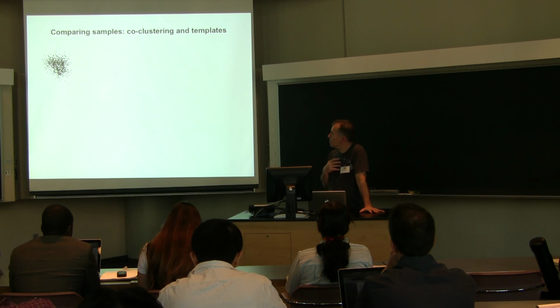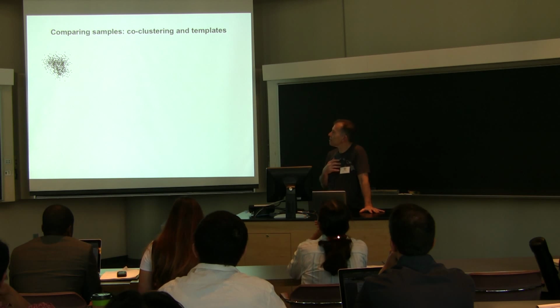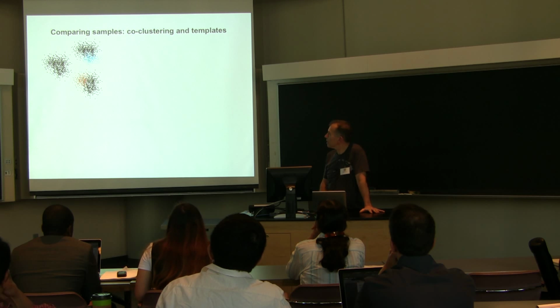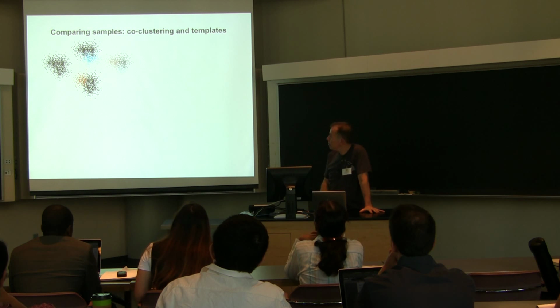And so here's an example of a population of cells. And you might look at that and say, well, that looks like a cluster. Or you might look at it a bit more and say, nah, that shape looks kind of suspicious. I think there's maybe an extra cluster there. And you could decide maybe the bottom blue one is a separate one, or maybe the red one, or maybe you decide there's actually 3 clusters there.